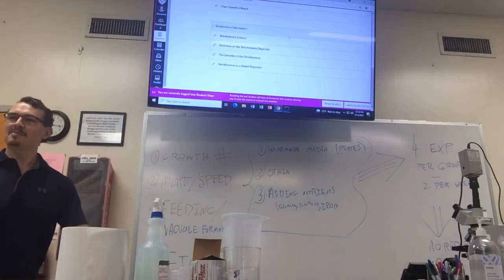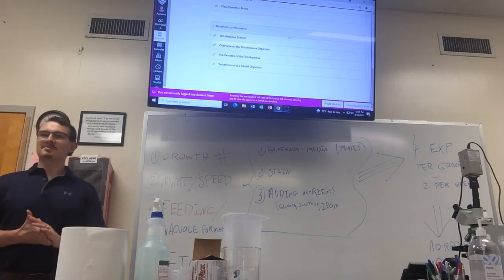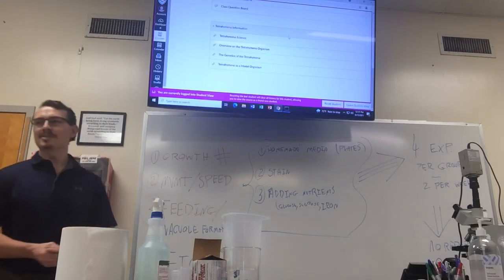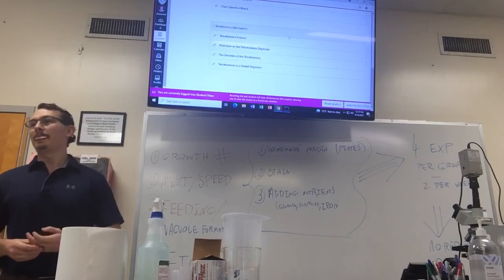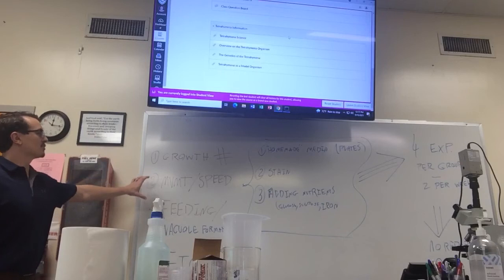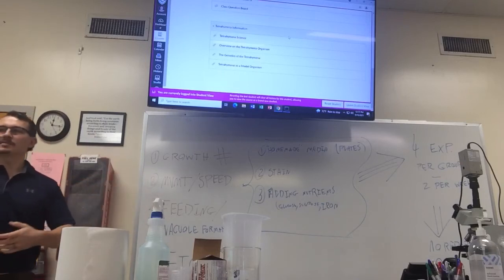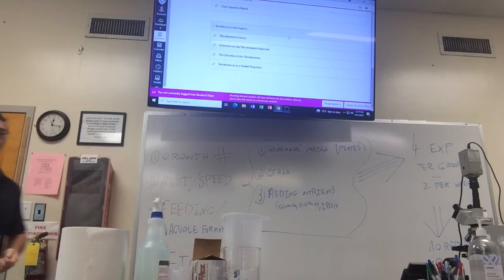Are there any questions about that? I know it's brand new, it's probably unclear. Any questions about the experiments? So today is both growth number and movement speed? Today is mostly movement speed, because there won't be really time to see how long it takes for them to grow. So today will be movement speed, and next week will be vacuole formation.